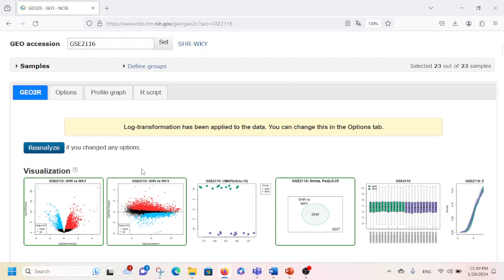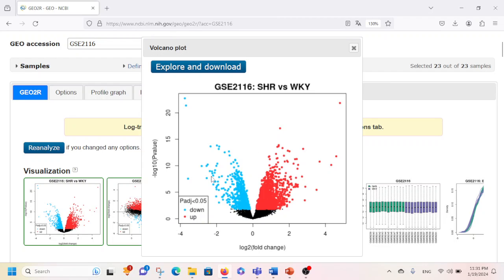This graph is called a Volcano Plot. Blue refers to downregulation and red refers to upregulation. The genes that were downregulated are represented by blue color, those that were upregulated are represented by red color, and those that were neither downregulated nor upregulated appear as black ones. You can see there are many genes that are upregulated and many that are downregulated between these two groups — SHR versus WKY.